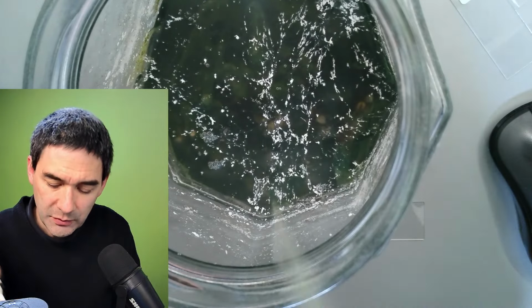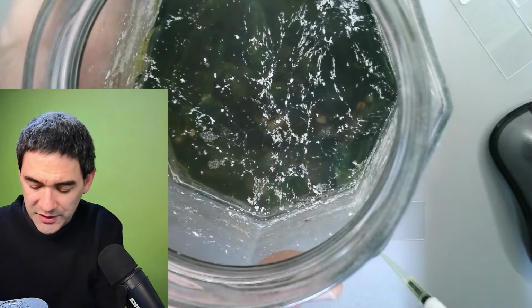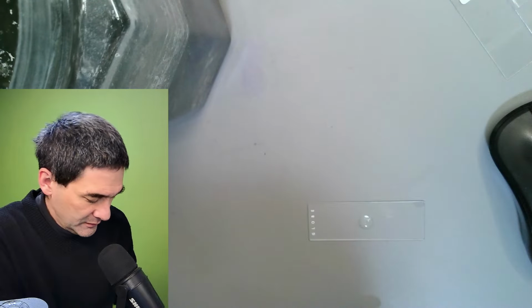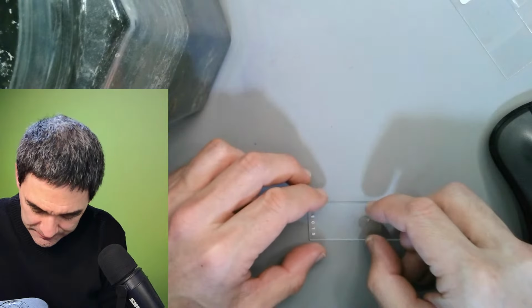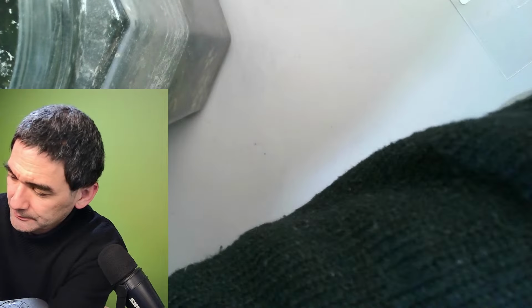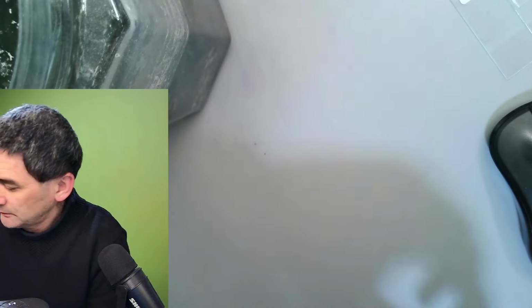So I'm going to take something right from the very top. Okay, you have not seen that because it's over here. Cover glass goes on top, obviously. And under the microscope. Let's put this away here. Where is the scope view?